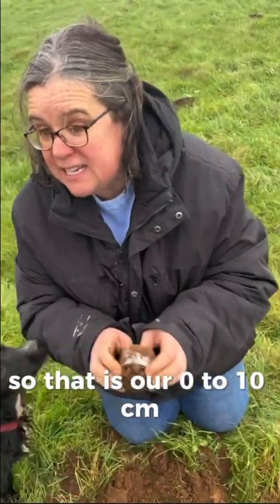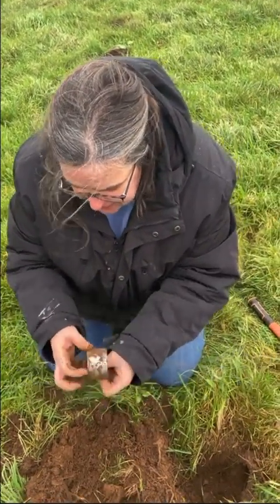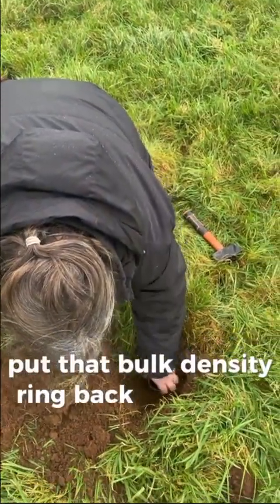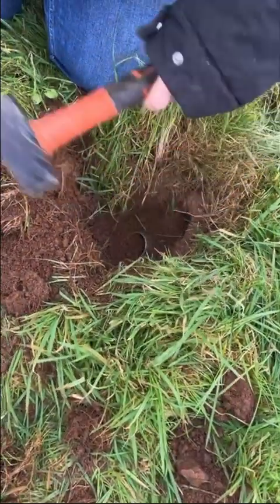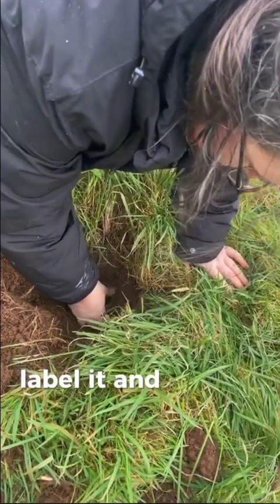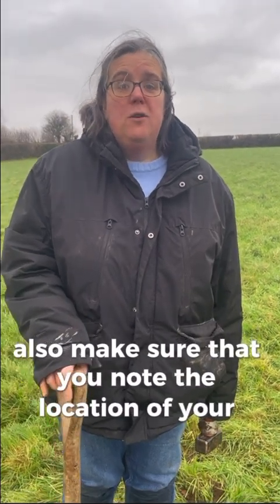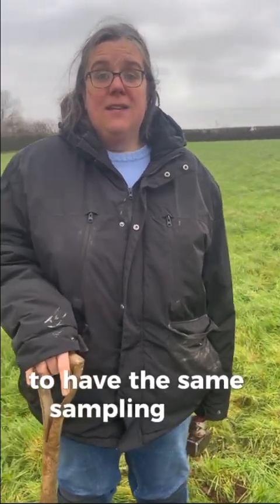So that is our 0 to 10 centimetres. We then need to do a similar one at 10 to 30 centimetres. So exactly the same as we did with that one. We need to put that bulk density ring back in the soil at that deeper depth, hammer it in, take it out, and then again put that intact core into the bag, label it, and send it off to the lab. As we did when we were taking the soil samples with the auger, also make sure that you note the location of your holes to make sure that we can then return back to those holes in the future to have the same sampling sites.